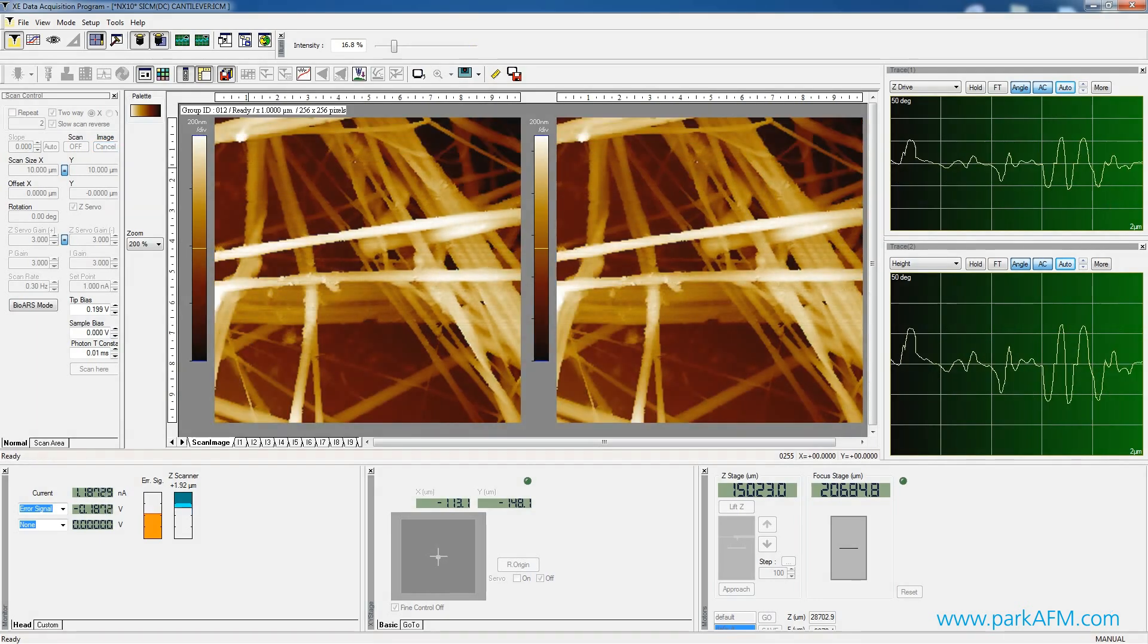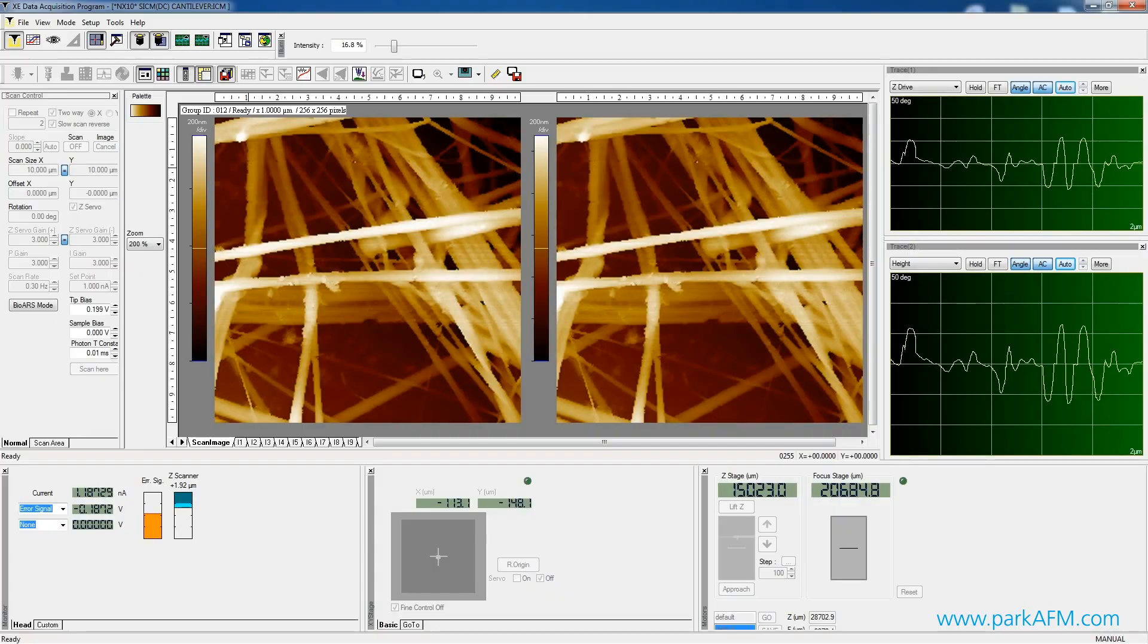As shown in these images, the protein bundles as well as each individual fibro can be clearly identified in the 10 micrometer-sized images at a 256x256 pixel resolution. Based on the fact that there is no real contact or force between the end of the pipette and the sample surface, this resolution is quite impressive.